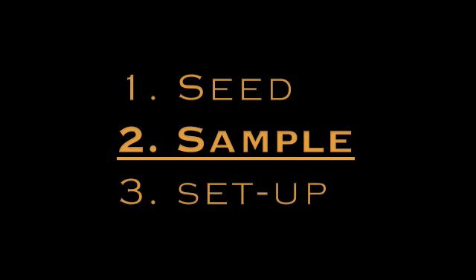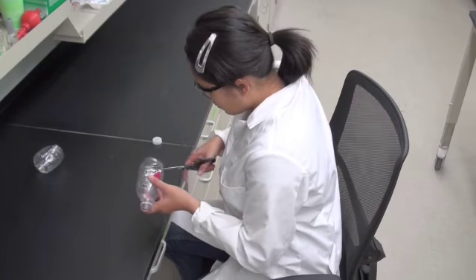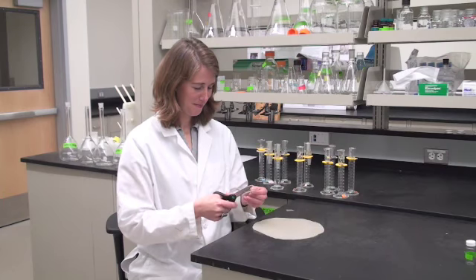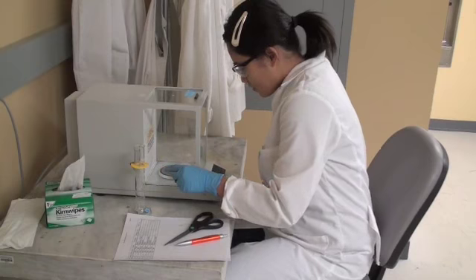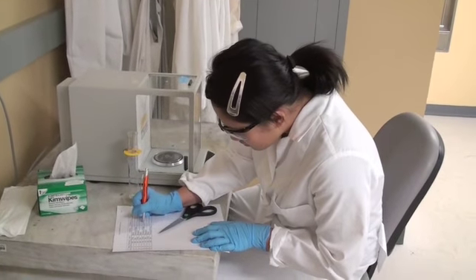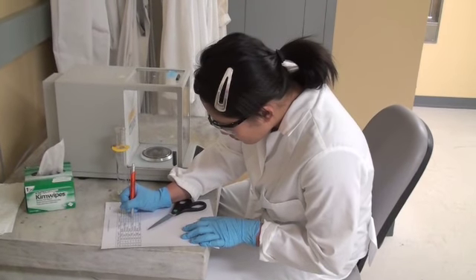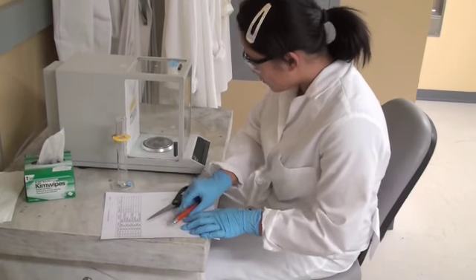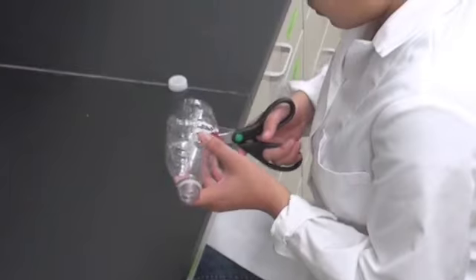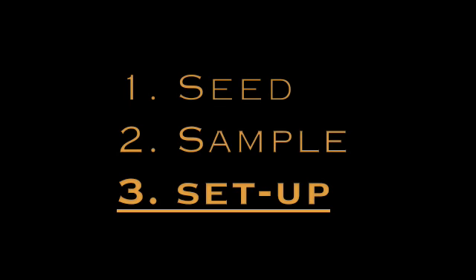Next, we need the sample, which is the material we want to biodegrade. Today we are comparing a petroleum-based plastic with a bioplastic. For quickly biodegrading materials such as our bioplastic, we use 0.07 grams of the material. For adequate biogas production, you may have to vary the size of your sample. Make sure you record the sample weight. Now that you have a seed and a sample, you need the supplies for the setup.